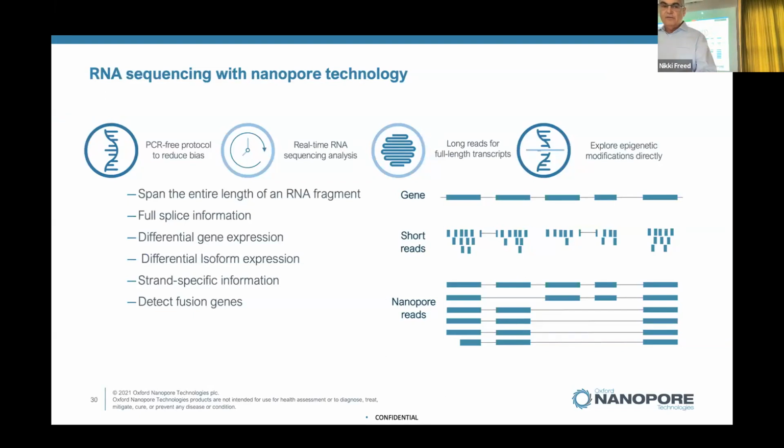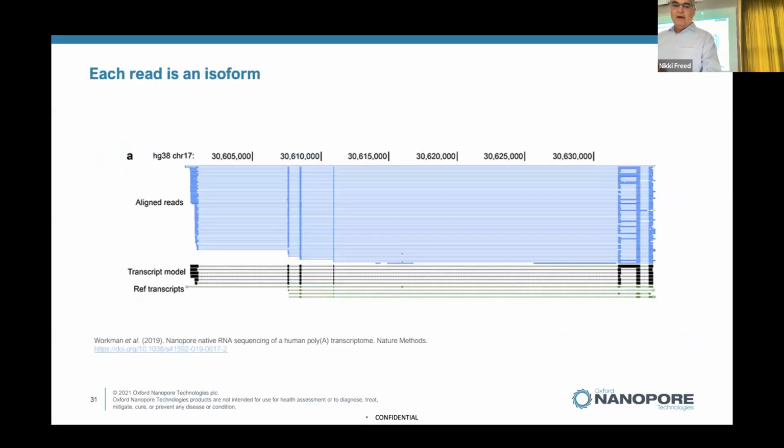So finishing off with transcription analysis, and I'm particularly passionate about this, and I appreciate that Nikki put up Affymetrix, because I used to be the Affymetrix product manager before Thermo bought them, and I still like that technology. And Nanopore is really enabling some significant improvements over RNA-seq.